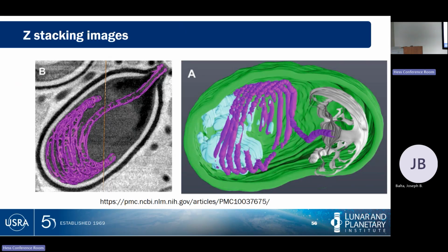We cannot do this on our SEM. And in fact, it was difficult to find a good image of this. It is possible on an SEM, including some digital tools today, to set an analysis where it will scan vertically and adjust its focus level, take a picture, adjust its focus level, take a picture, adjust its focus level, take a picture, and get a truly 3D image.